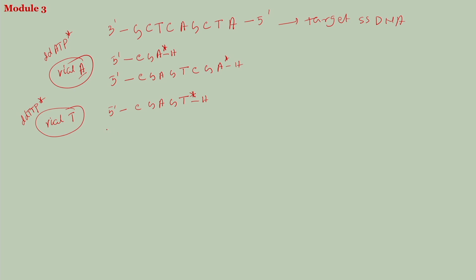Let us see if there is anything else. Yeah, the last one, C G A G T C G A, and the last one is T. So, this will also show you the radioactive label.